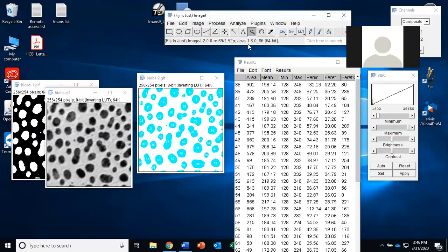I think an important distinction also is that co-localization on the level of, let's say, entire tissues or entire big pieces of muscular fibers or whatever is a different thing than co-localization of vesicles inside of a nucleus.